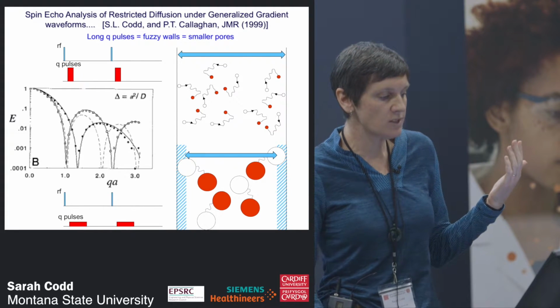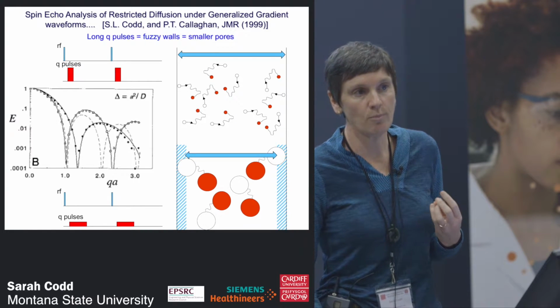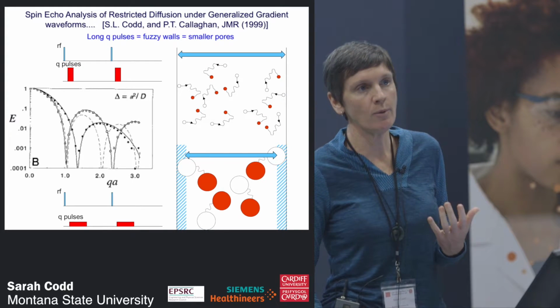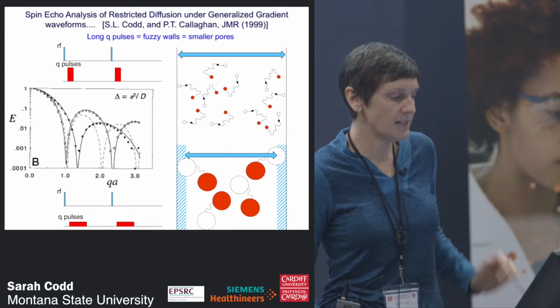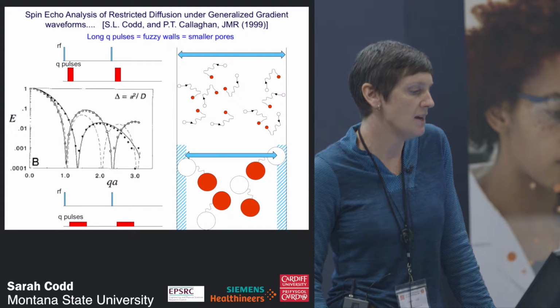Paul's extension of that was to realize you could use matrix multiplication mathematics to model those processes. And so Paul had done that with narrow pulses, and he wanted me to take this and show that we could do it with finite pulses using this matrix multiplication method.